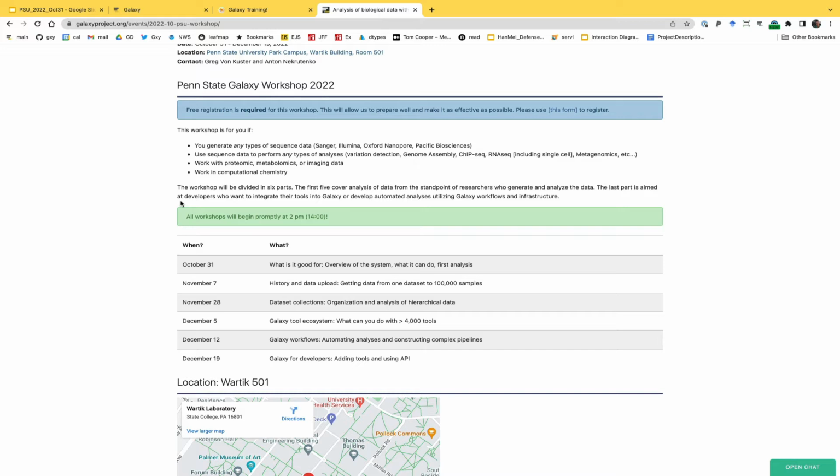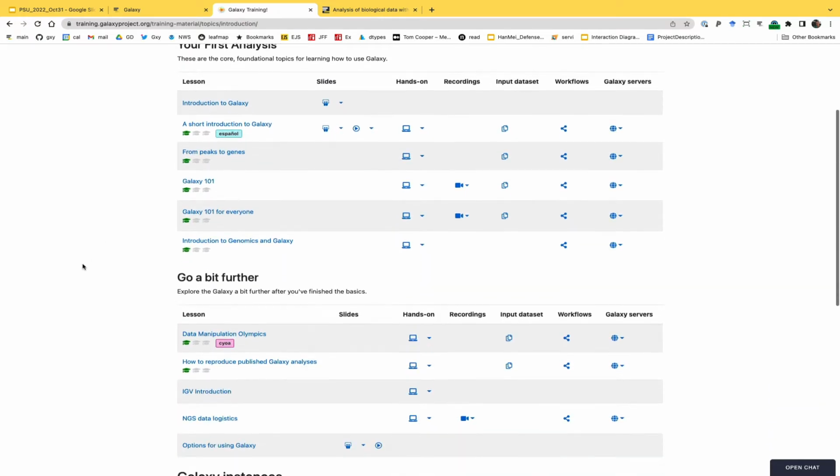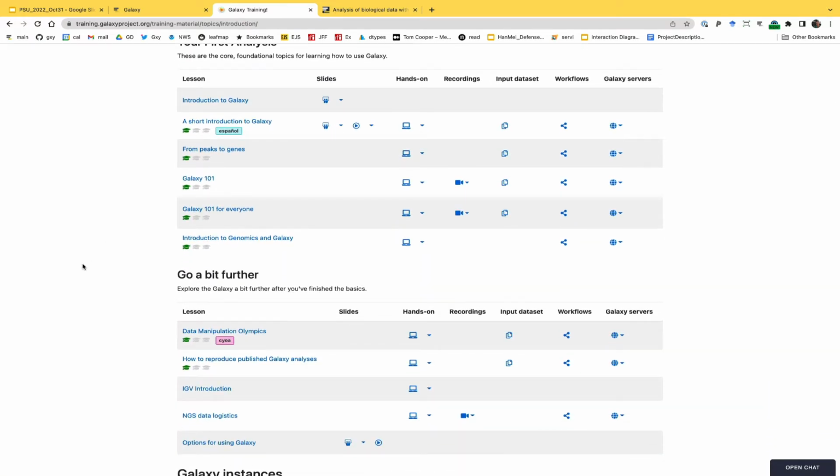Okay. So let's go to the training page and let's go to Introduction to Analyses. There's lots of them. So there's Galaxy 101, which I first did probably 12 years ago. Of course, it's all updated. But I thought that we're going to do something slightly more advanced than usual. And specifically, we're going to do this data manipulation Olympics. It's a good exercise to go through.